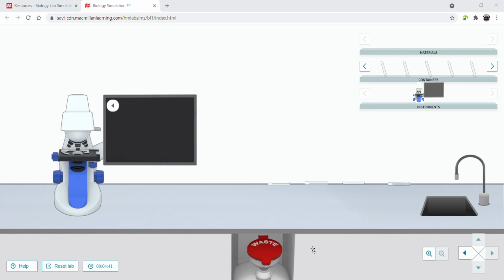So if you scroll down to the exercise, you see pages 3 and 4 all go through the different procedures as far as how to use the virtual microscope. Now, if you are watching this video, it means you have a slow internet connection and you're not doing the virtual lab itself. So you don't need to look at that for the filmed version of this particular lab.